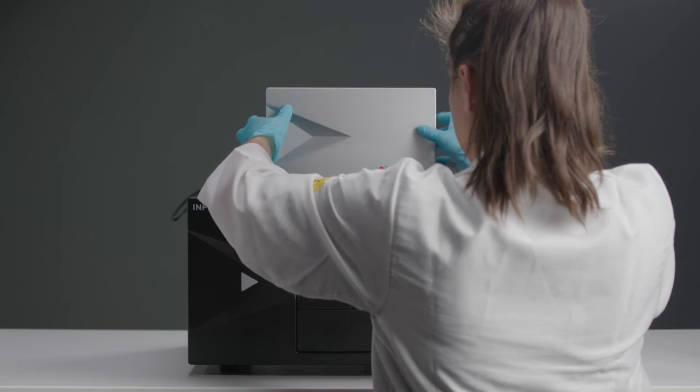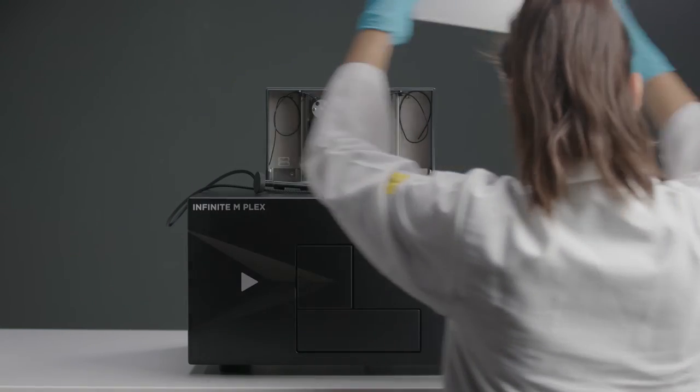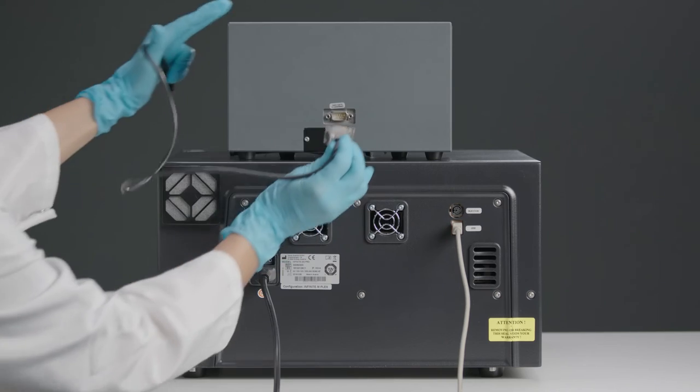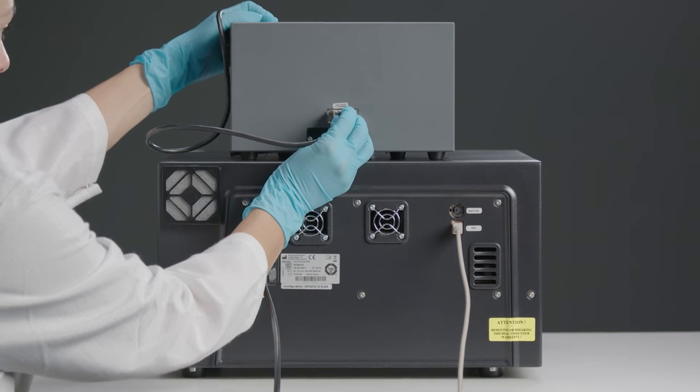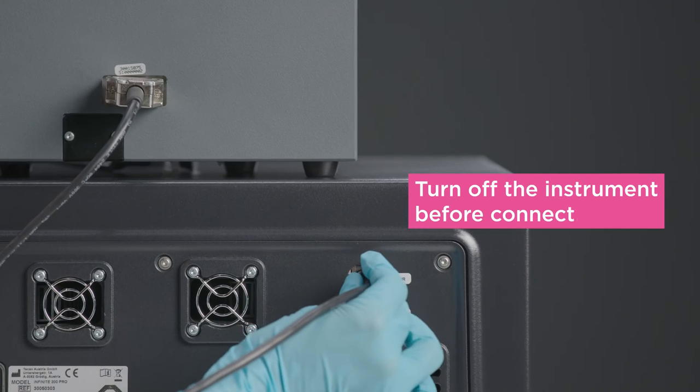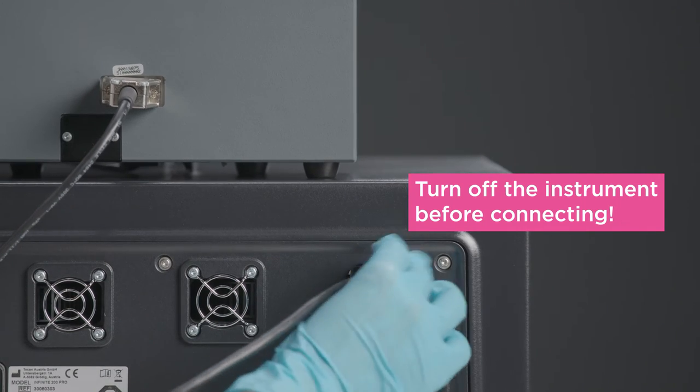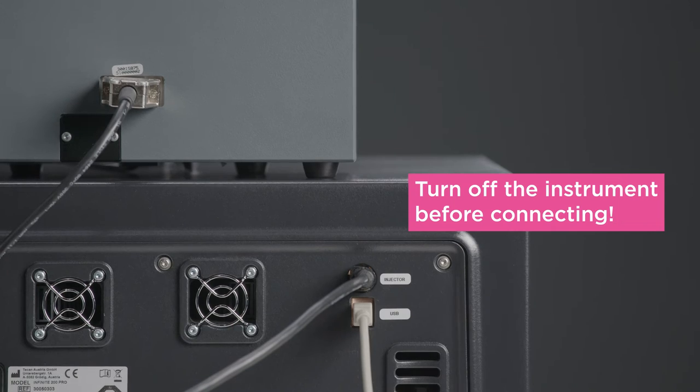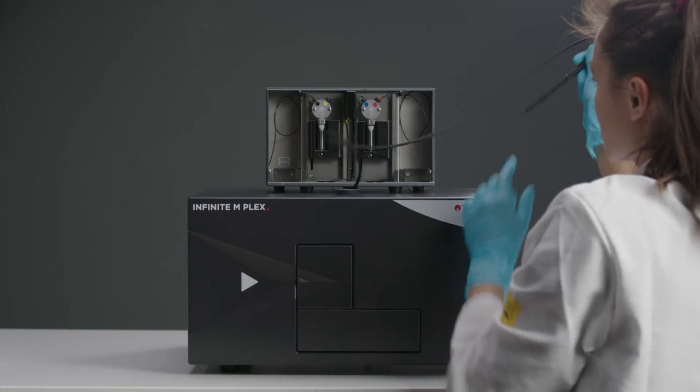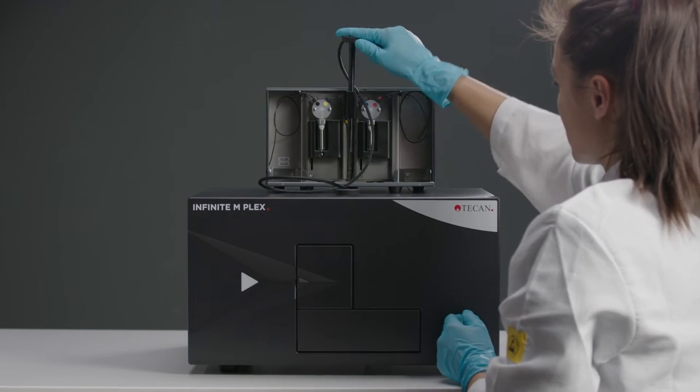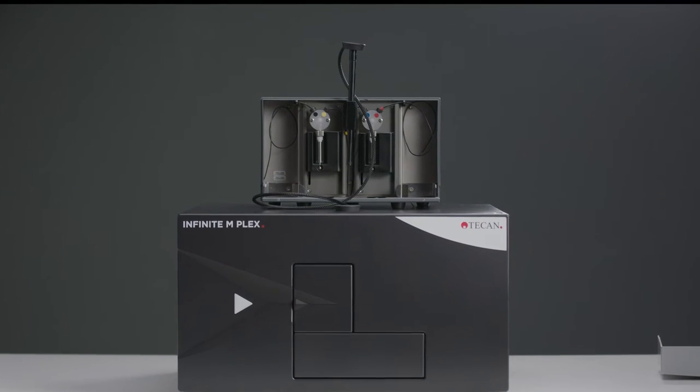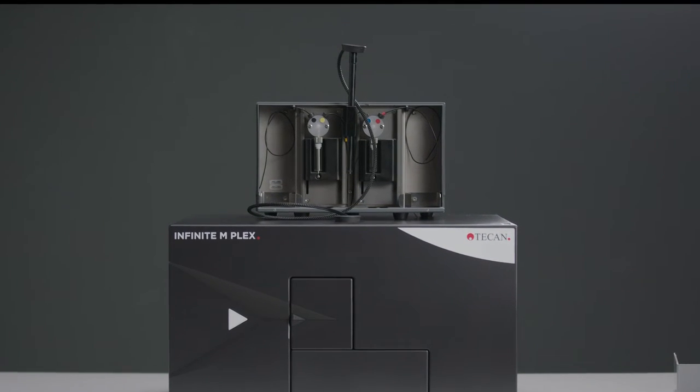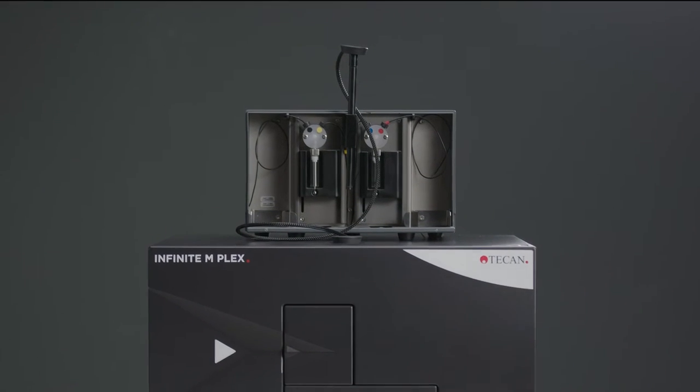If you have an injector module, make sure your instrument is switched off. Put the injector module onto your device and connect it with the cable that we've provided. Never connect or disconnect the injector module while the instrument is turned on. Before using the injector, remove the dummy and insert the rod. You'll find detailed instructions on how to use the injector module in the manual.